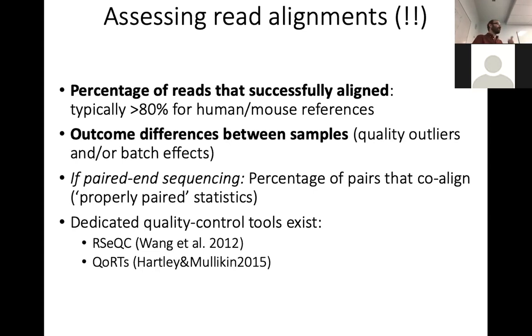So once you've done the alignments, once you've run the program, the first thing you want to check is whether the program has actually run. So you want to see if all the output files exist and if they're non-empty, and if the error logs are free of errors. If somewhere in one of the logs the program tells you there was an error, then you have to rerun the program in a different way after fixing whatever the error was. But even if the program runs, what you want to check is the data itself.